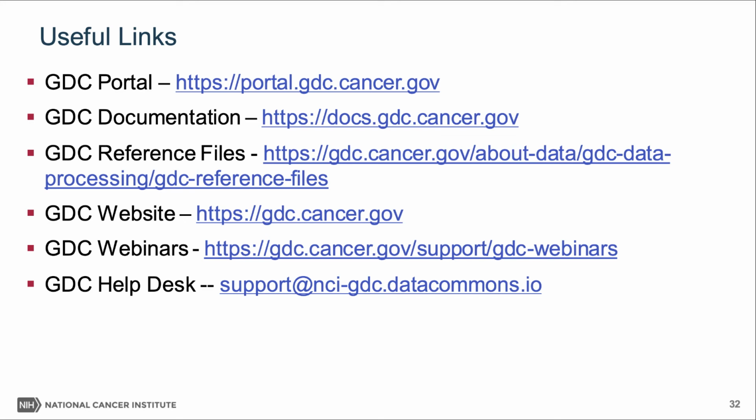And also the Sesame workflow: we have some description in the GDC documentation of how this works, but there is a more detailed 2018 paper published on this pipeline, the Sesame, that describes how to use this workflow.